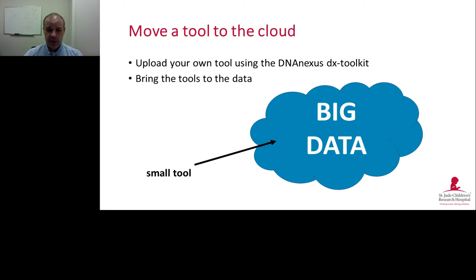So Clay just showed you how you can run a St. Jude tool on your own data. But how about if you want to run a novel analysis, something that we might not have a tool for, on our data, or indeed on your own data within the cloud ecosystem?